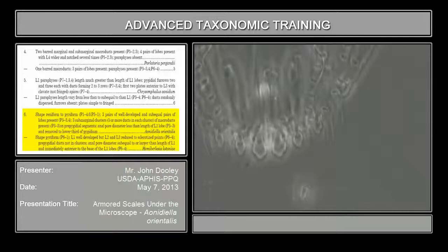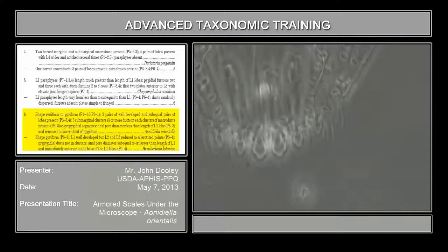As I said before, sub-equal — these do reduce a little bit in size. But shape-wise, they're all pretty close together, and they're usually notched on both ends as well. That's something to look for on medium lobes — you can see where they're notched on both ends, almost equal, and then rounded in the center. That also shows these are clavate-type structures, and you'll see they have no fringes, unlike others where you have fringes — they call them tines, like little combs. They have all kinds of cute names for all these structures.